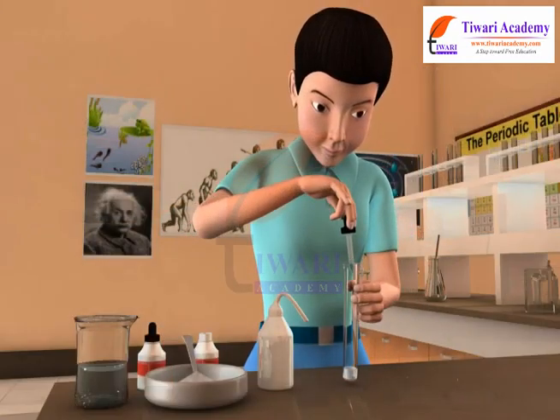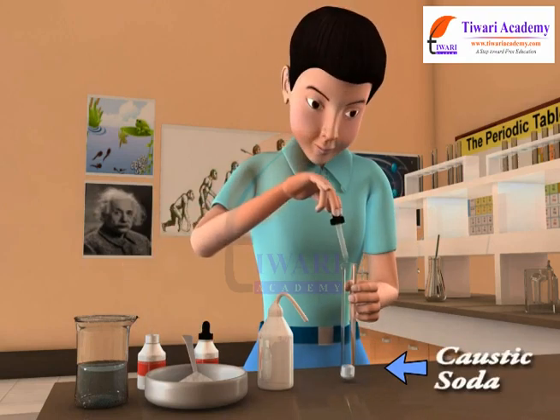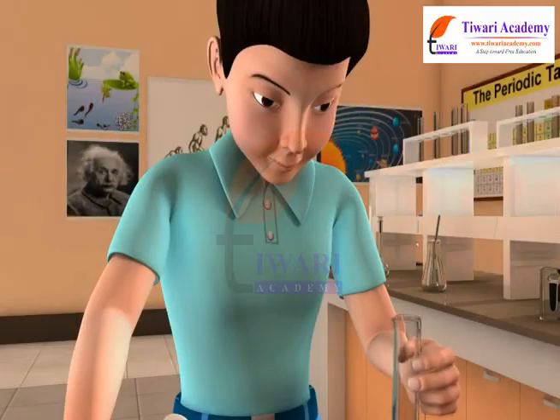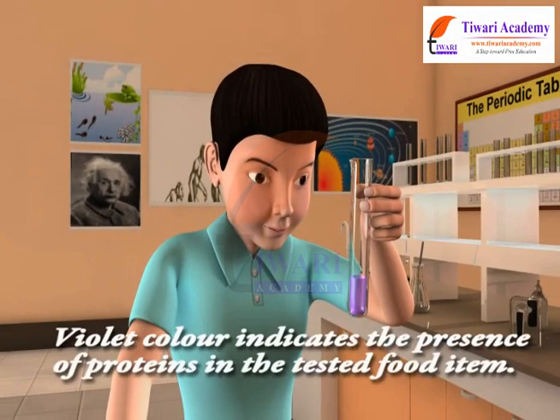Now add 2 drops of copper sulphate solution and 10 drops of caustic soda solution to the test tube. Shake the mixture well. Observe the color of the mixture. Violet color indicates the presence of proteins in the tested food item.